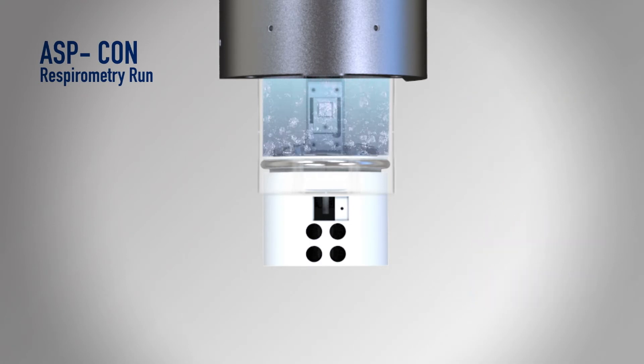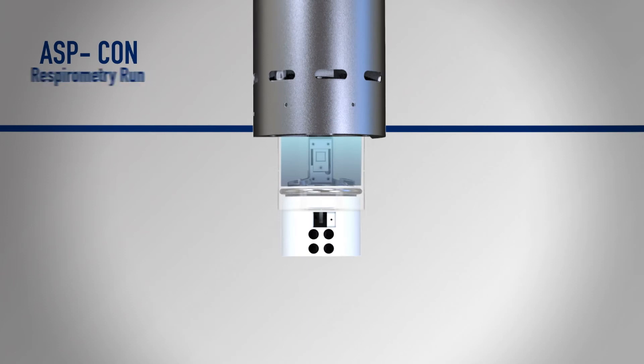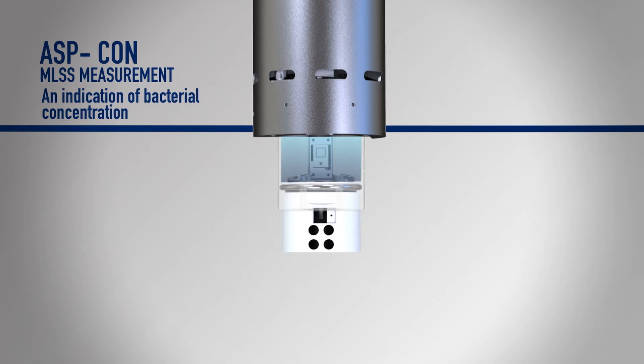From here, two different actions can then be performed. Firstly, to carry out a mixed liquor suspended solids measurement, the sample is pushed up past the sensors by raising the core and sample exhausts through slots in the outer casing.